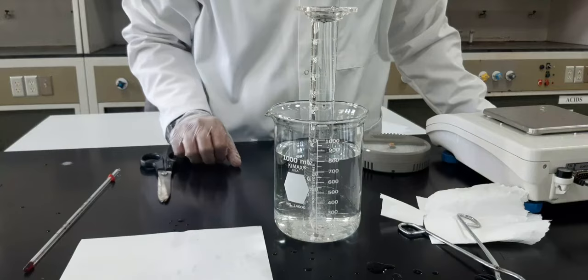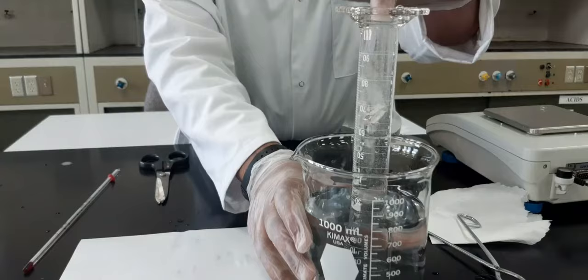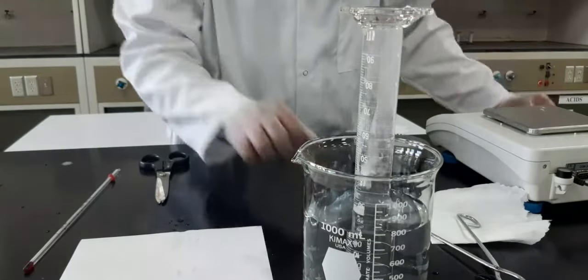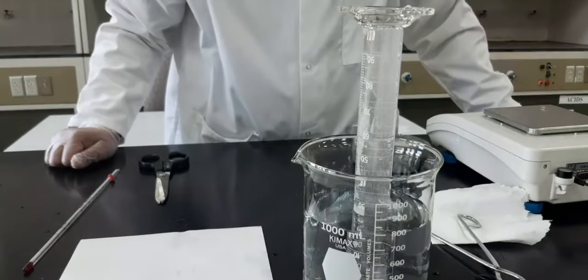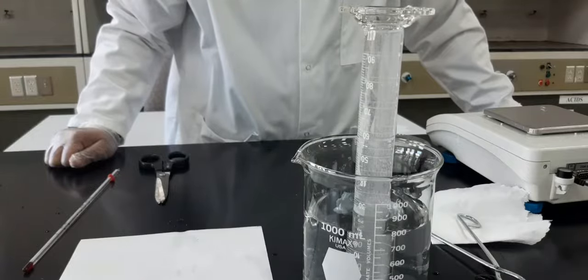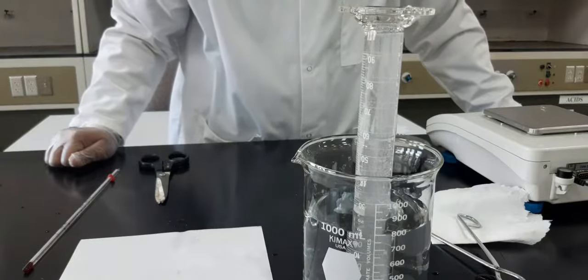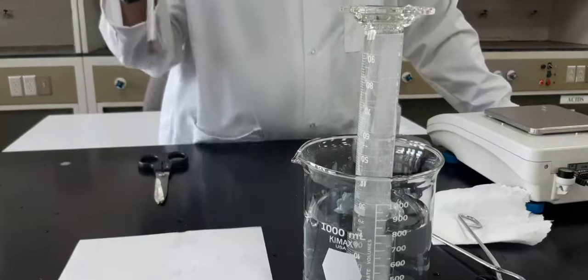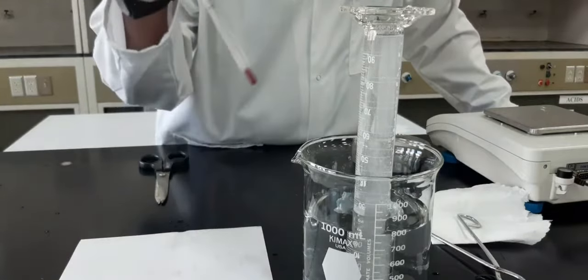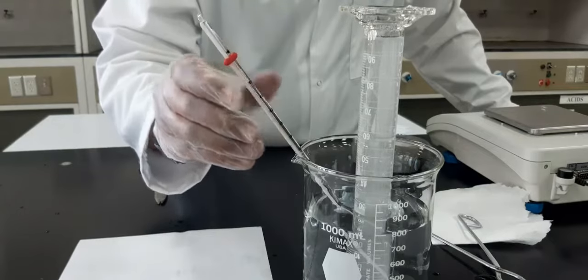Now you are starting to see some bubbles coming. This is hydrogen gas. Visualize it like that. In this reaction, copper is just holding the piece of magnesium down there. The copper is not going to react with hydrochloric acid. Only the magnesium will combine with the hydrochloric acid, forming magnesium chloride and hydrogen gas, and the gas bubbles you can already see inside the cylinder. At this moment, you can add the thermometer to check the temperature in the beaker and leave it.